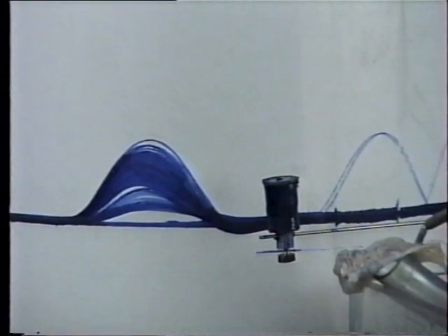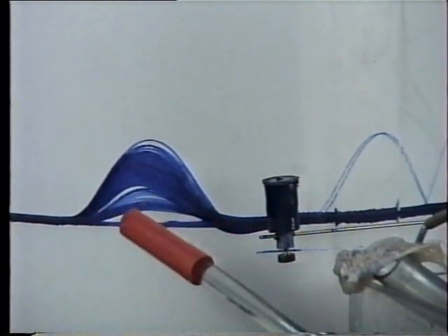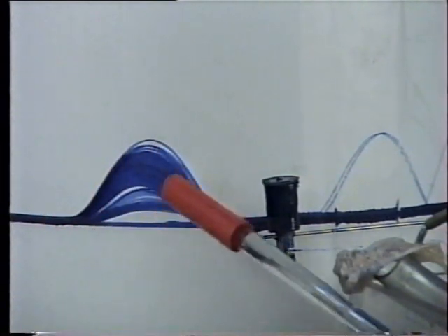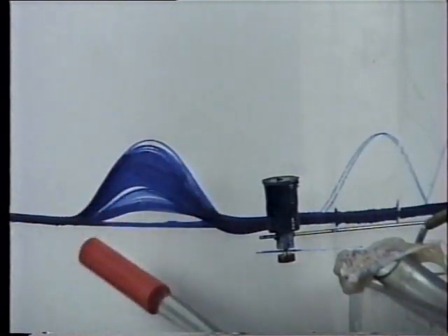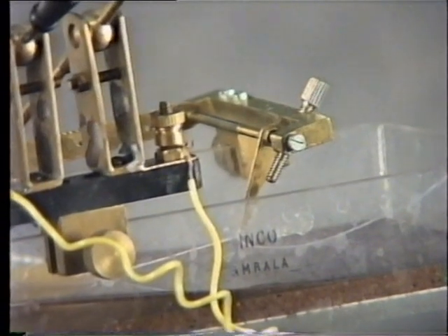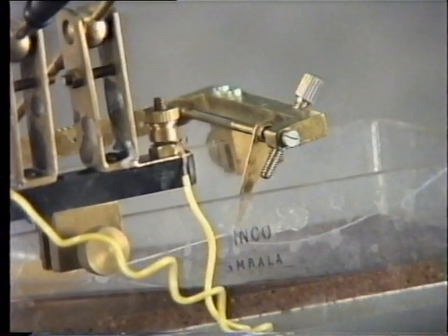Continue the recording until it reaches the baseline. Now you can see the decrease in amplitude, prolongation in the contraction, and prolongation in the relaxation — the latent period is also increased. This experiment is to show the effect of load and afterload on the mechanical efficiency of muscle. Arrange the apparatus.